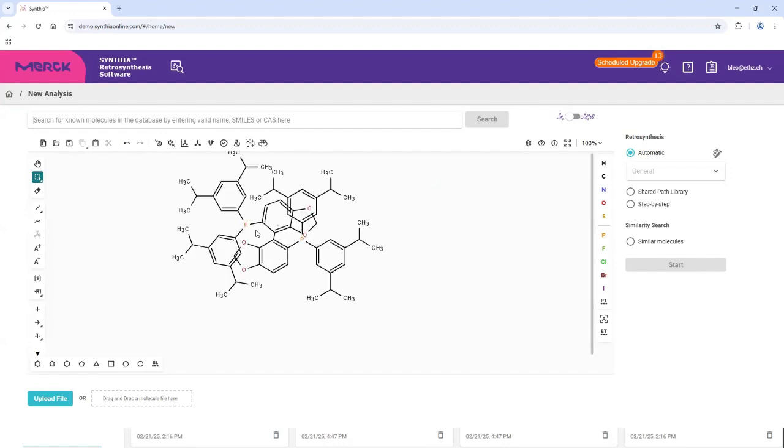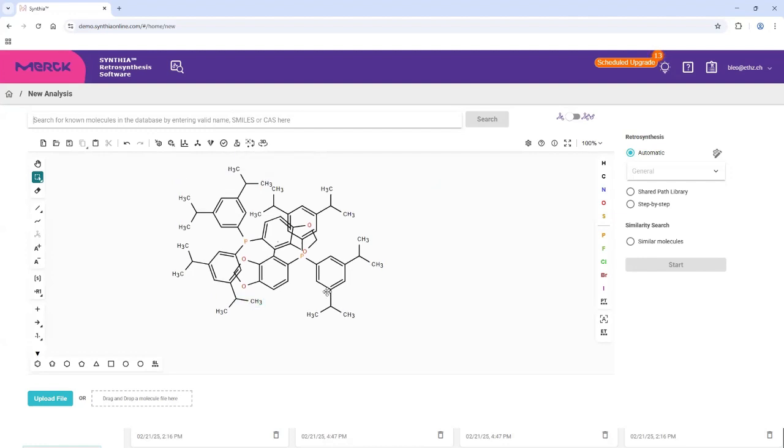Oh yeah. So here I have, of course, some BINAP derivative, and then I can choose some of my algorithms, and that's where I have the problems today, because now this is grayed out and I don't know why, so I cannot really start the search.